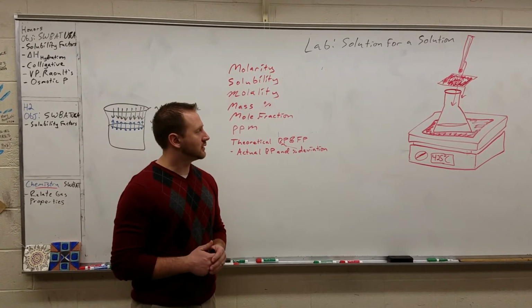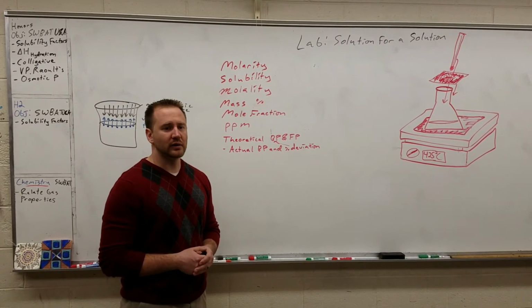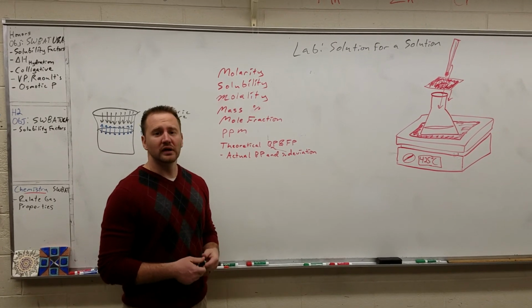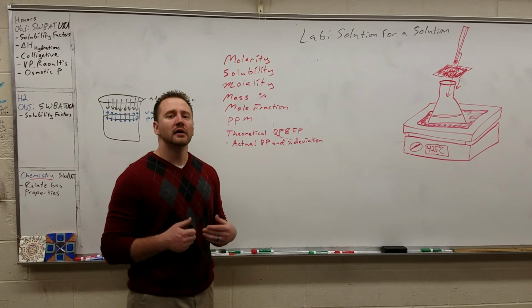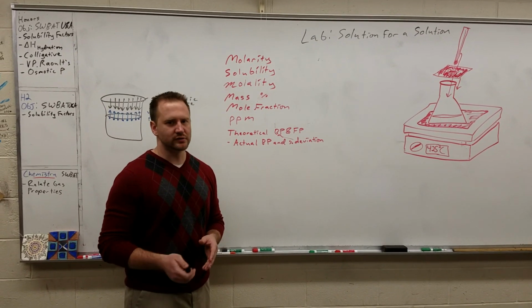And that's basically the lab. There are several sources of error you might run into, and in your lab report I want you to account for those as well as demonstrate all the calculations. In the introduction, I want you to describe each of these things that you're going to be calculating and basically give a problem-solving strategy for how you're going to reach each of those values.